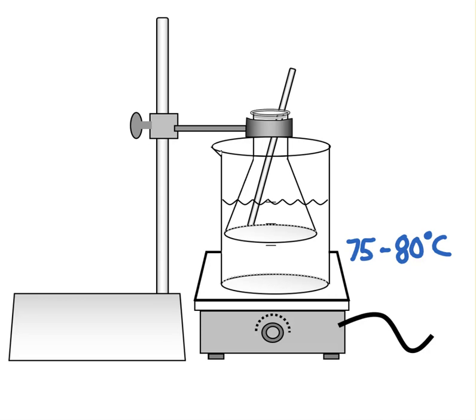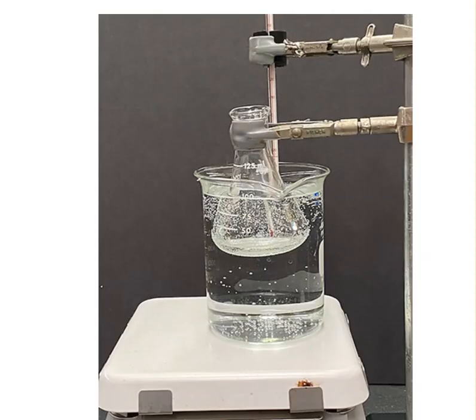So anyway, we have it dipped down into this warm water, and at this point the salicylic acid powder causes this to just go clear, so it just looks like water in there. And here is a picture of the actual setup as we say that our aspirin is cooking in that little flask.